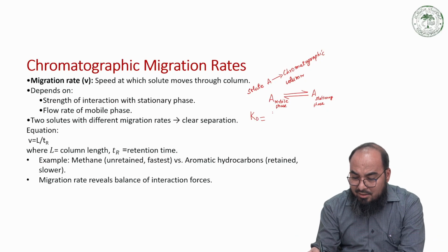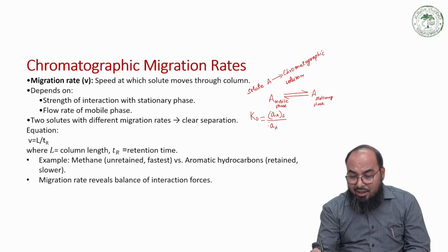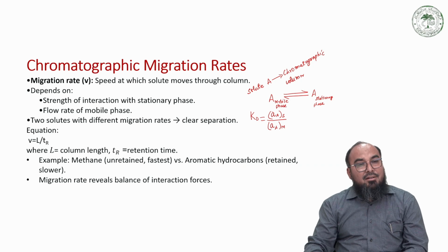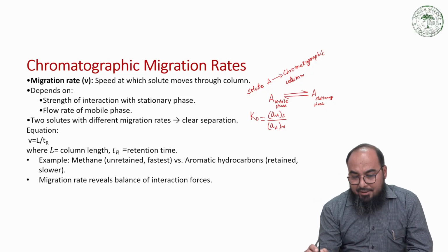That is, activity of solute A in the stationary phase upon activity of solute A in the mobile phase. So this is how we define the equilibrium constant, and this Kd is actually the distribution constant, which we are going to discuss in our next coming slide.